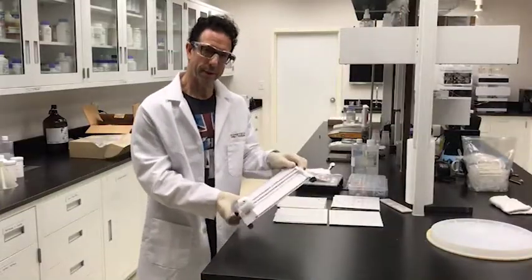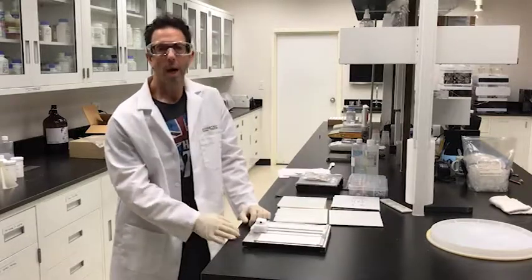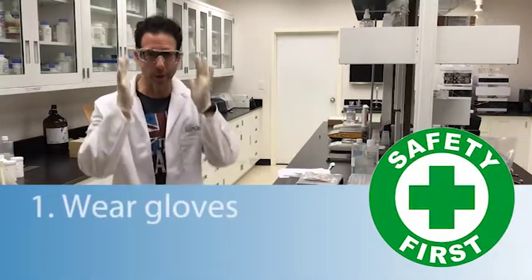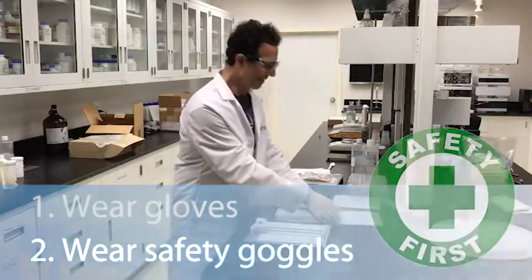Here we are with an awesome glass TLC plate cutter and some samples of TLC plates. I also want to bring up a very important issue: safety first, always, when you're in the lab — even for the simplest tasks. Wear your gloves and wear your safety goggles, always. So let's cut some plates.